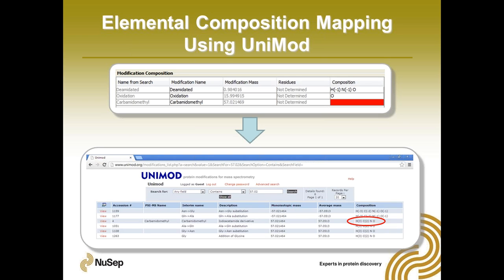All right, since we're now converting all of the peptides to their elemental composition, so carbons, nitrogens, sulfurs, oxygens, etc., there's a new page in your wizard, and this is probably the most confusing change in the software and the thing that's going to trip you up the most. But really, this is the best way we can figure out to do it for you.